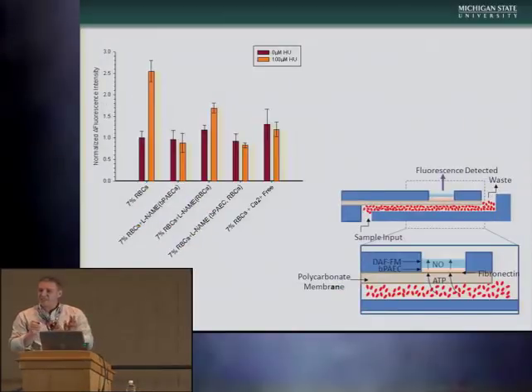And again, to prove that this is an eNOS-related mechanism, eNOS needs calcium calmodulin for activation. We do this in a calcium-free buffer, and again, you see no nitric oxide produced in the endothelium. So again, some really nice work here to demonstrate that the downstream effect of this hydroxyurea may actually be an increase in endothelium-derived NO. And again, our group isn't the first to suggest that nitric oxide has been important in sickle cell. In fact, there's some very nice NMR work and EPR work over the past few years showing that NO, again, is a major determinant in sickle cell.